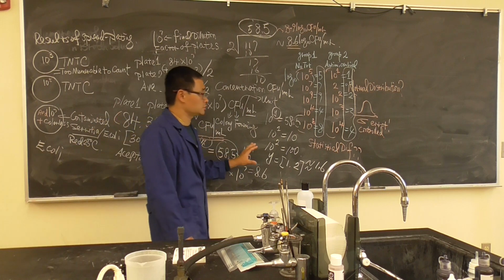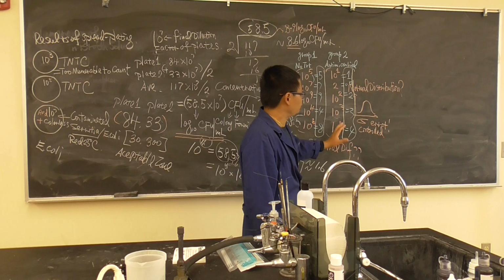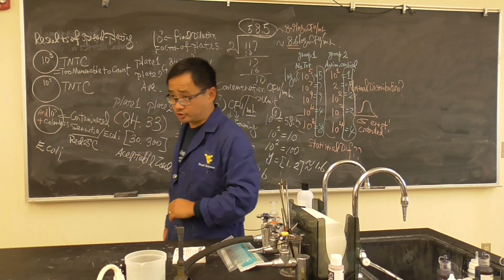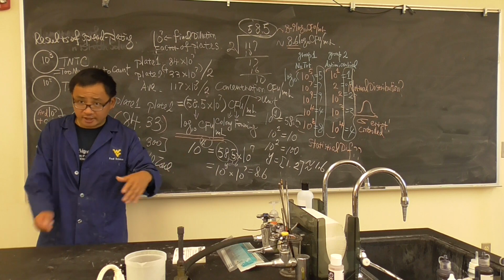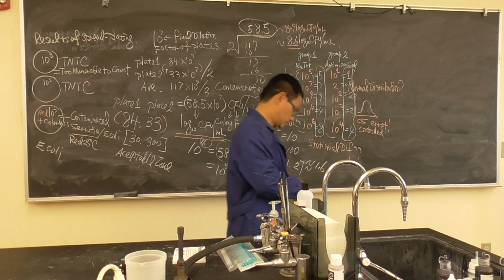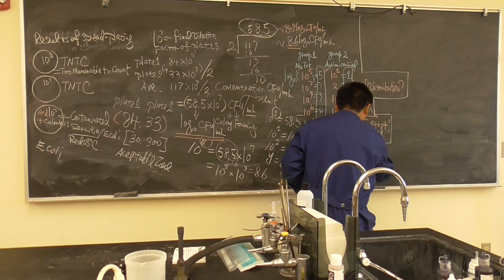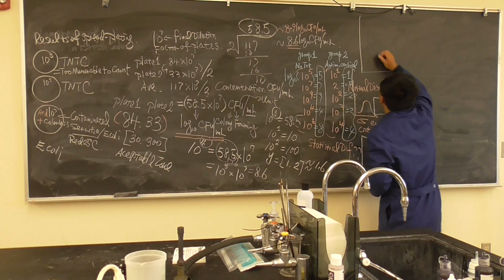The reason to do this is that if it is a statistical analysis, the data need to follow normal distribution. And when you transform to log 10, they can follow normal distribution. Otherwise, you can't do the statistical analysis. The reason is the error is too large. Anyway, there is no difference. Okay? So that's something we want to talk about. Today's work is very simple. Because you did the spread plating, the work is not difficult. We will do pour plating.